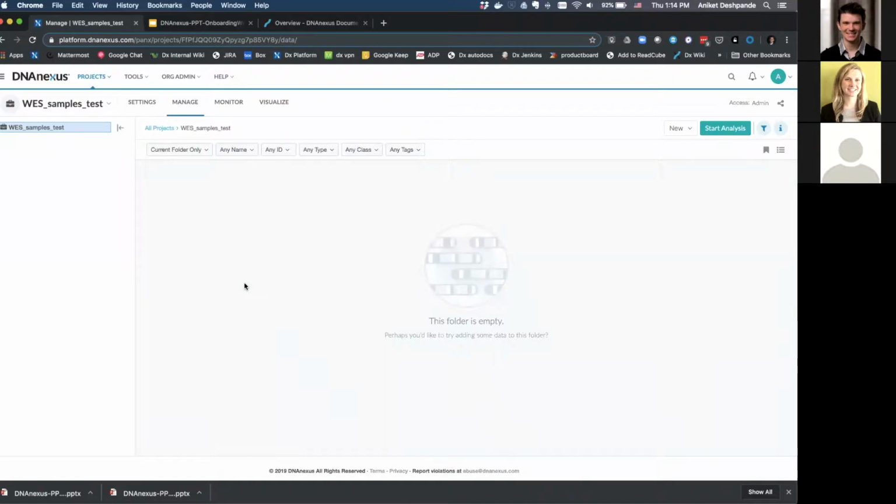But for the purposes of this demo, I'm just going to cover the 3 different ways of pulling data using the user interface. So I can go ahead to the new tab right here and click down on the drop down menu. The first and the easiest way is to upload data directly.